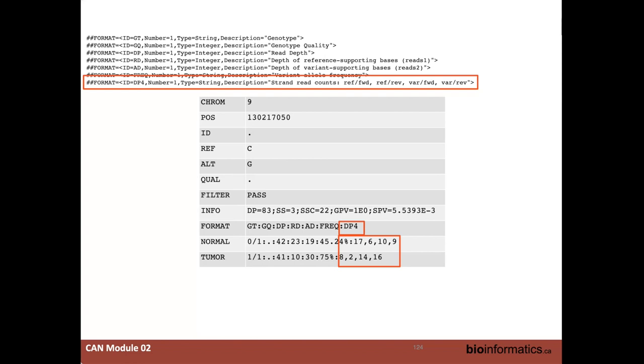Yeah, and I'll just add to that, it's buried in the default parameters somewhere, right? So when you run VarScan or MuTect2 or whatever, they have default parameters and they're not obvious. You have to look at the documentation. You can change them if you want, but usually these reads are filtered so that they exclude the reads that have a mapping quality of zero, right? The aligner isn't really sure that read goes there. So why would you use it for variant calling? So it gets thrown out.